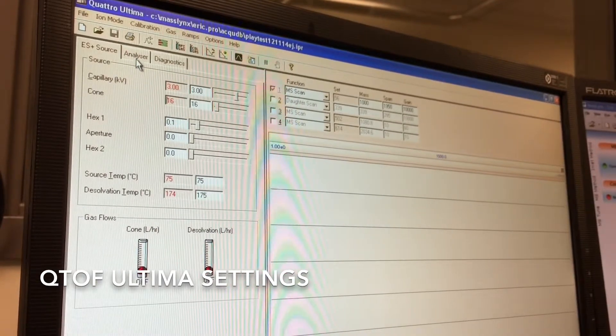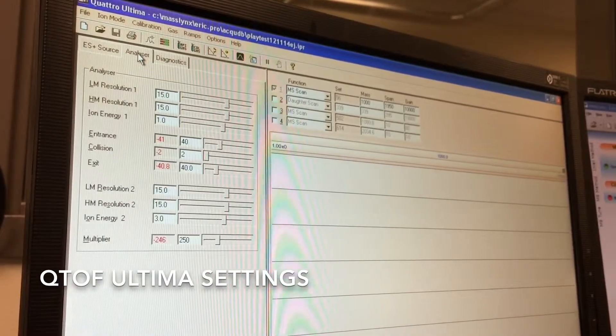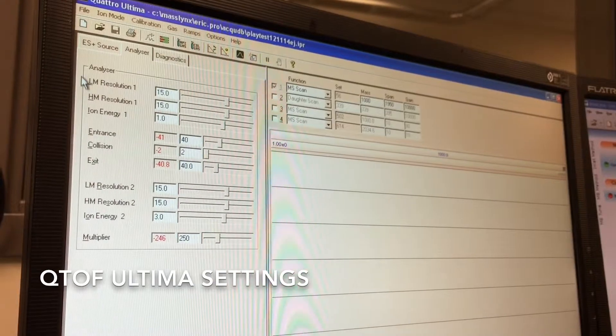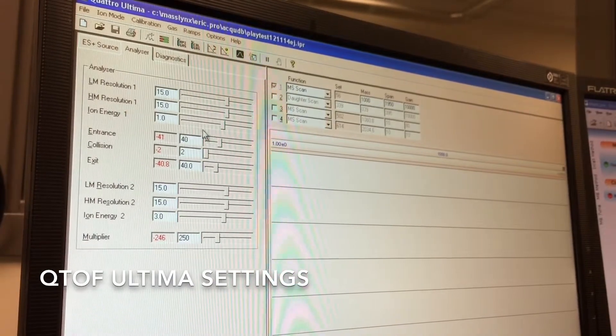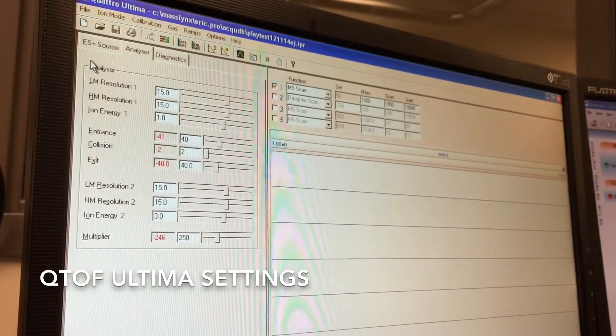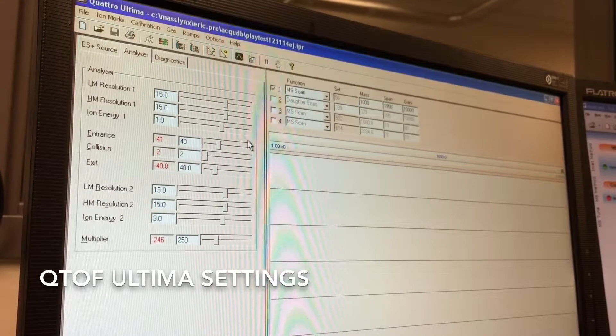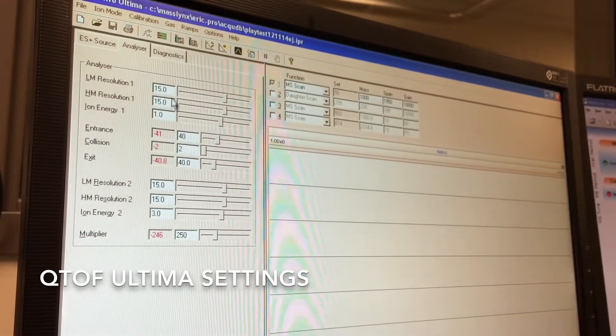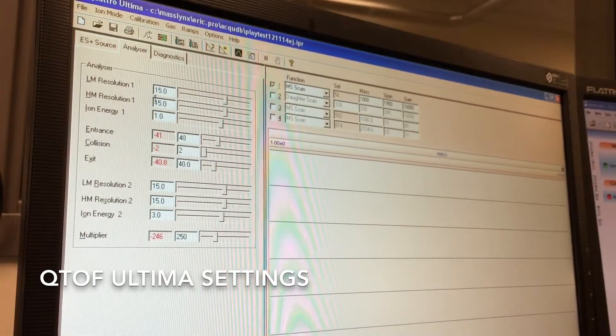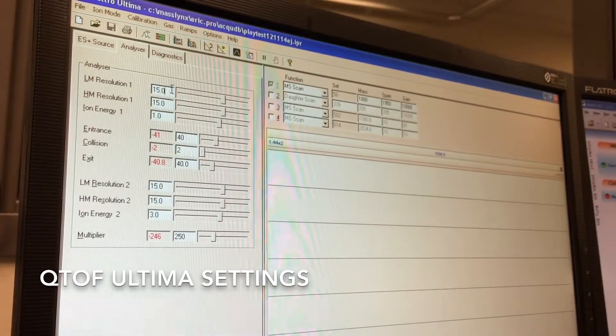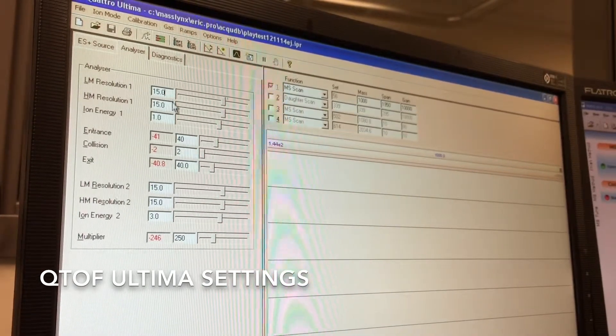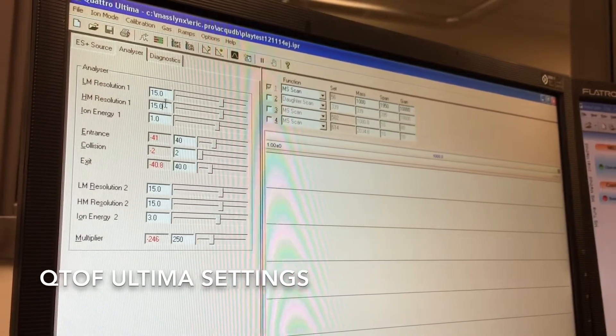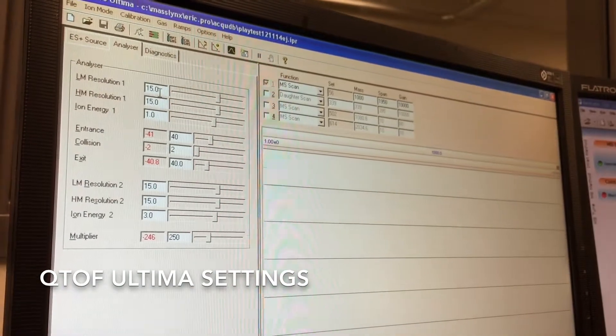The next tab is the only other important tab, the analyzer. This first set of three numbers here will dictate the resolution that you get out of the first quadrupole. If you want to increase or decrease those, you can go up to around 17.5 at a maximum resolution on this particular instrument or as low as 5.